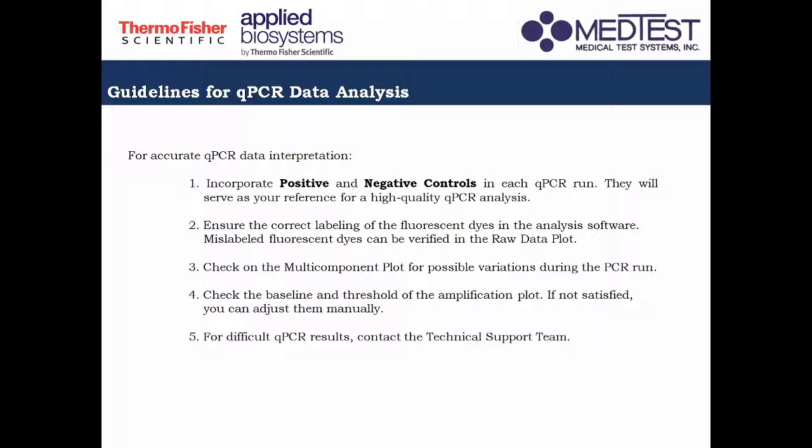Then you also need to ensure the correct labeling of your fluorescent dyes. So ito na yung sinasabi ko kanina. So when you mislabel your fluorescent dyes in your instrument, it would always result to a very ugly qPCR plot, amplification plot.